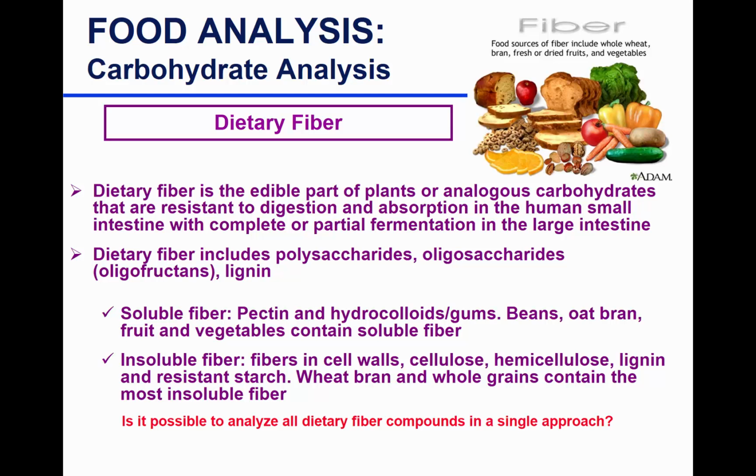So is it possible, since they are very diverse, to have one single approach to analyze dietary fiber? No, it's an extensive procedure and it's very involved because solubility is key. If they are different in solubility, then we really need to be creative in the method to make sure that the method we follow actually quantifies all of them.